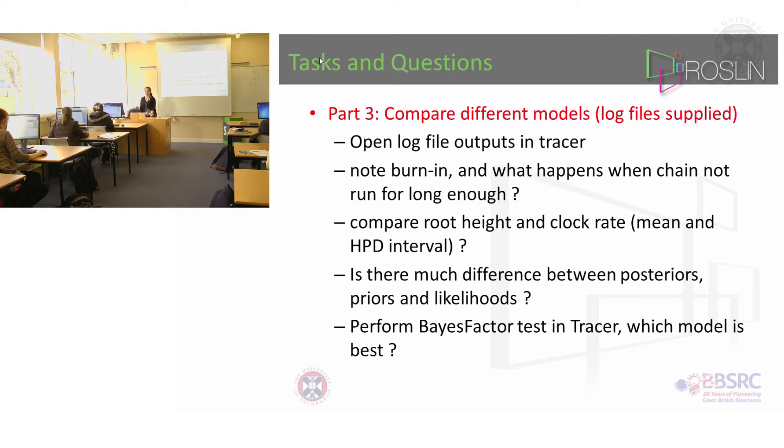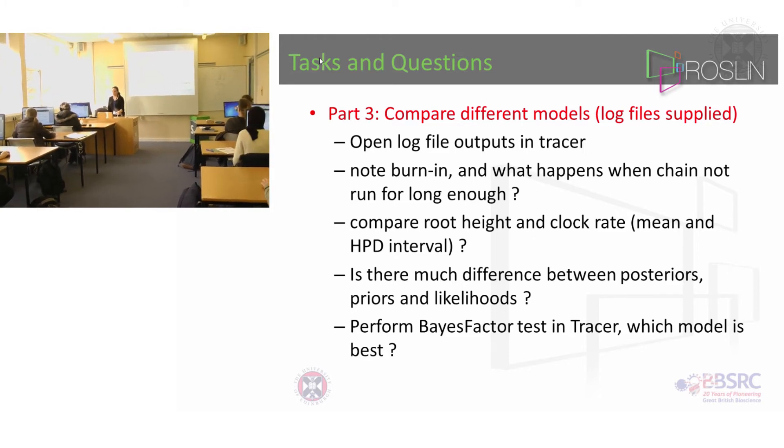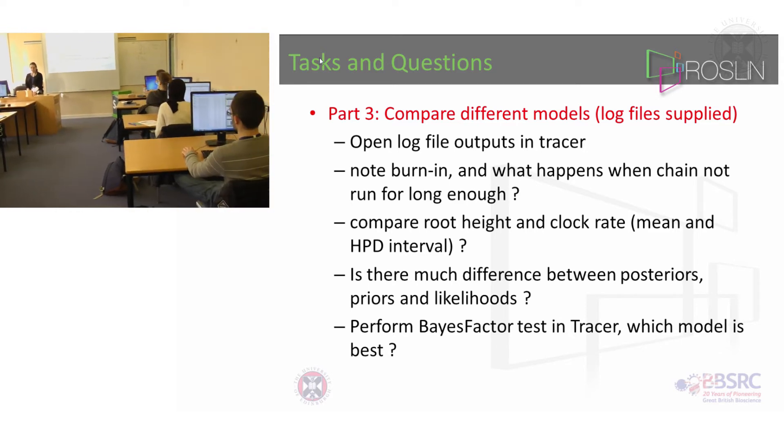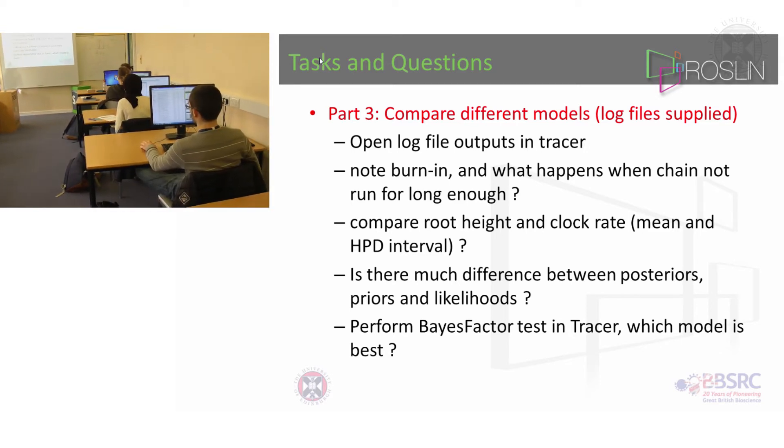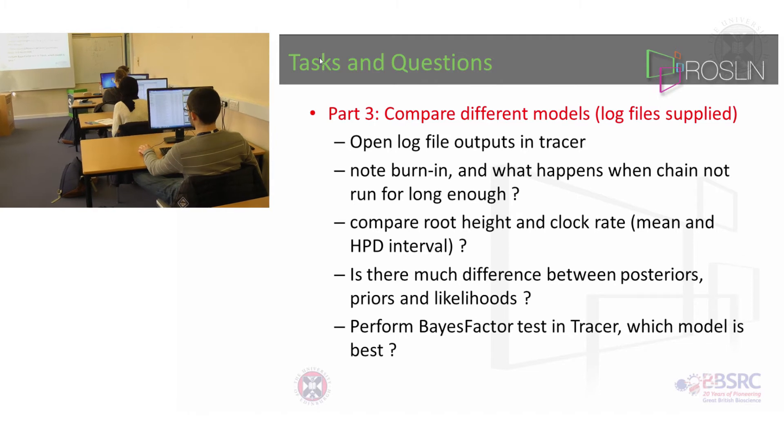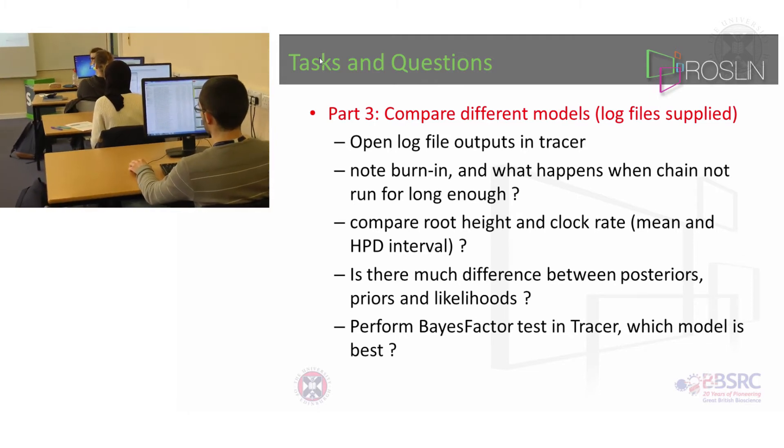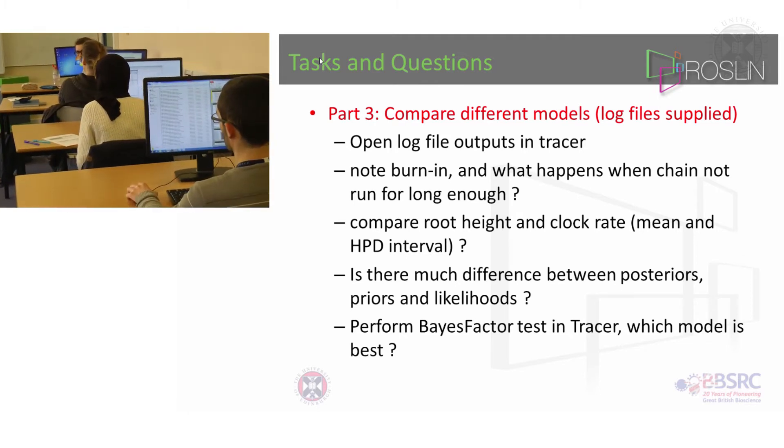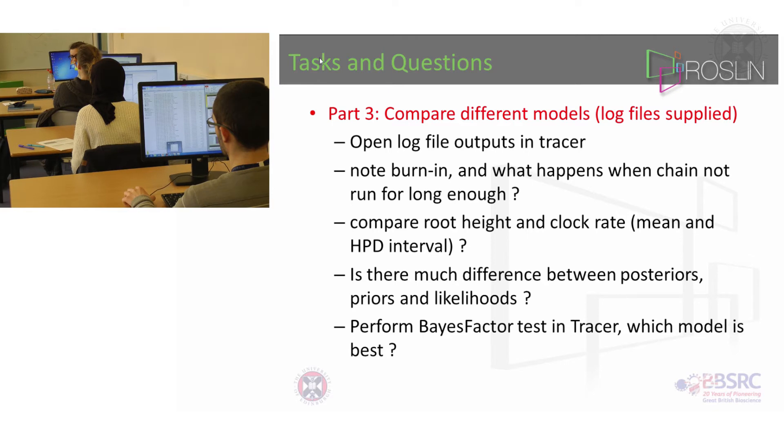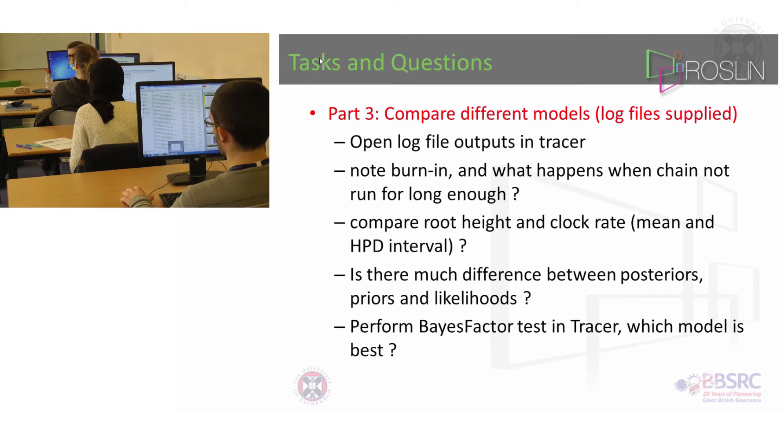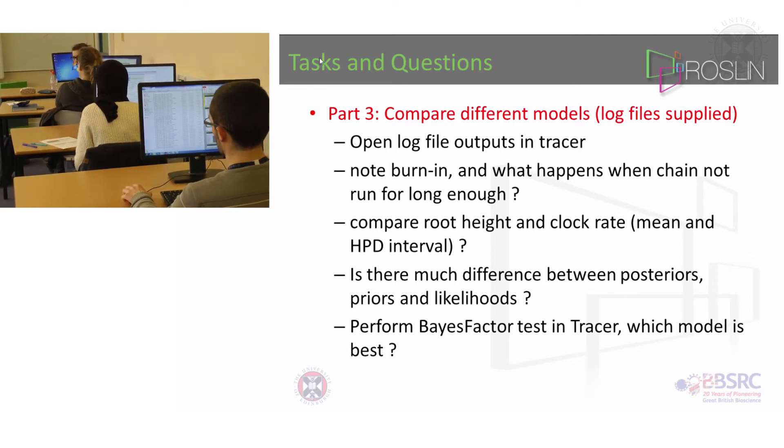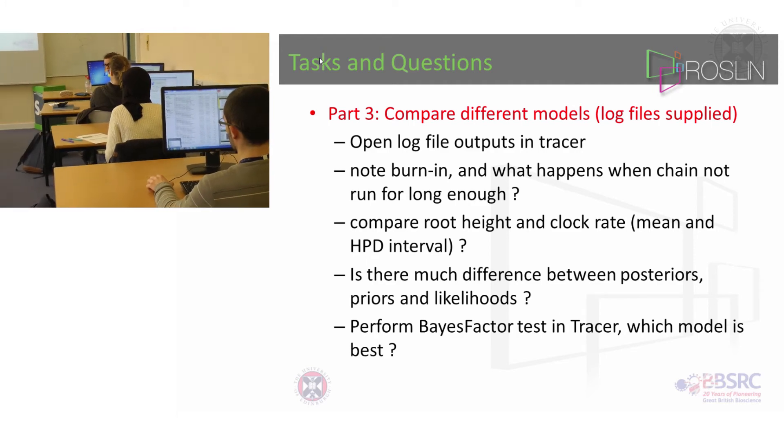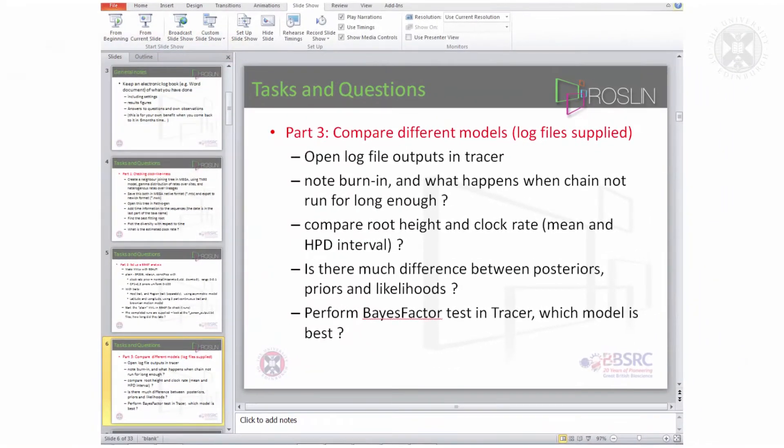So after you've made your BEAST xml file just try running it in BEAST to see whether it will run. When it runs then go to the animal bioscience directory and look in the runs for practical data and open them in Tracer. Let me show you Tracer.